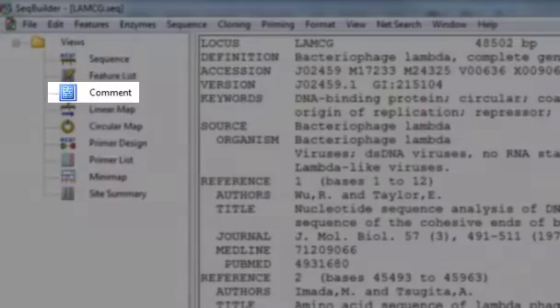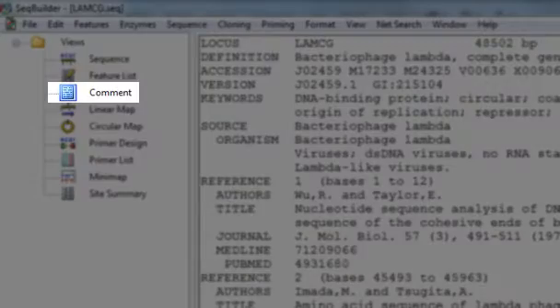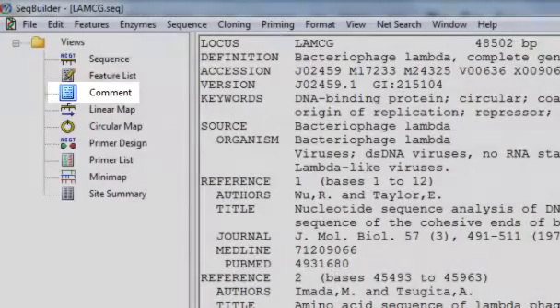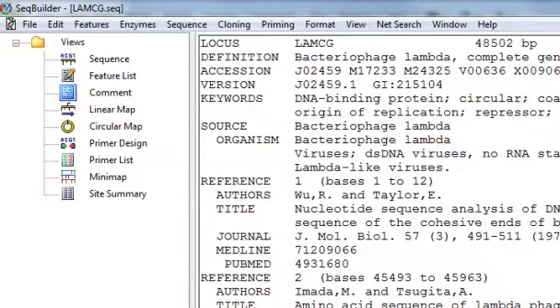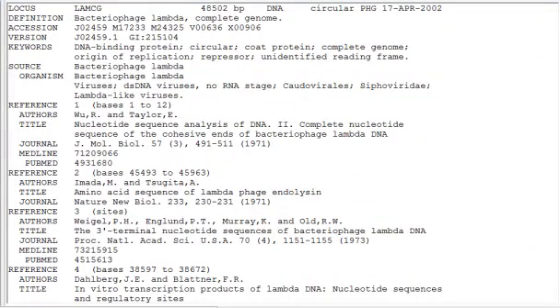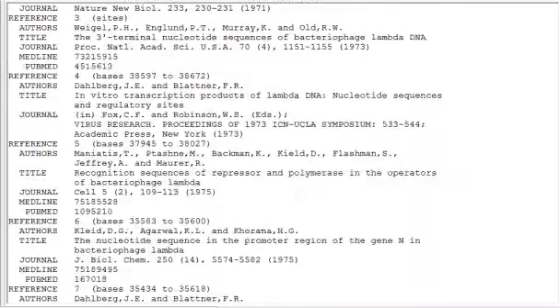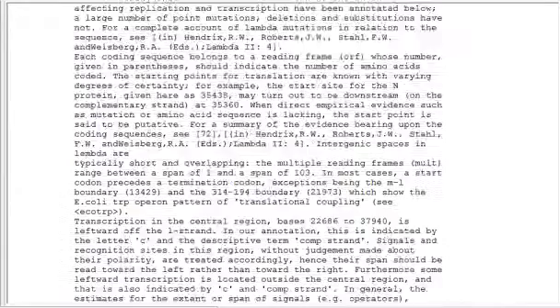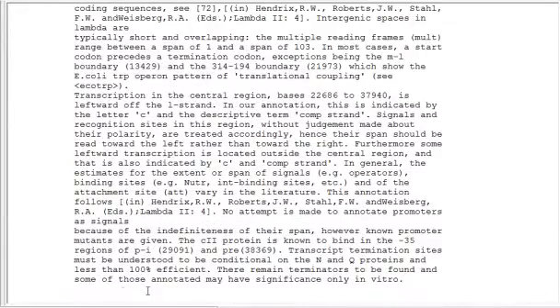The Comment View is simply a place to enter some descriptive text or notes about your sequence. If the sequence you are using is from GenBank, as this example is, then this is where the text of the GenBank entry is displayed. But you can also click anywhere in this view and simply type in your notes.